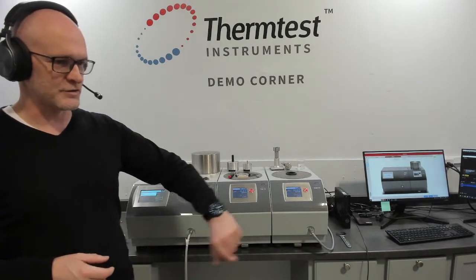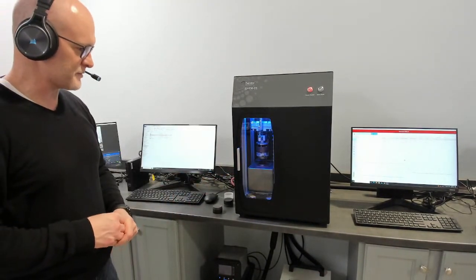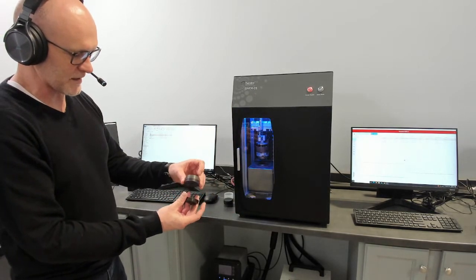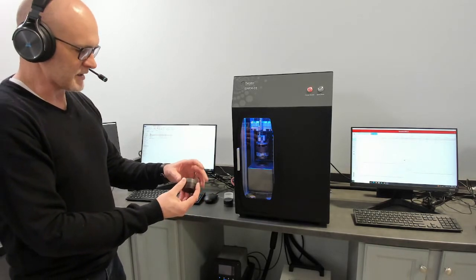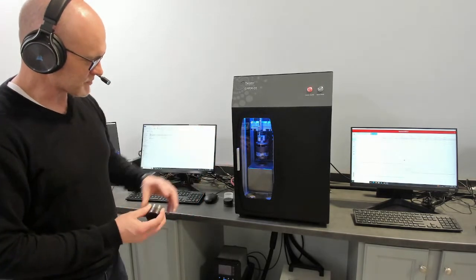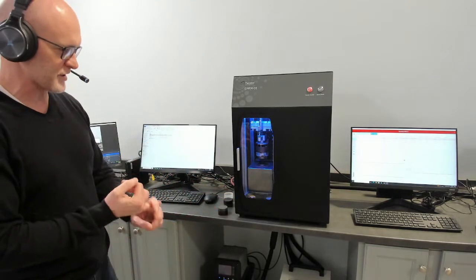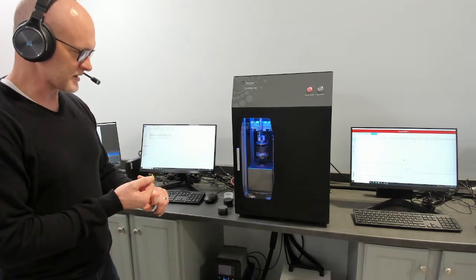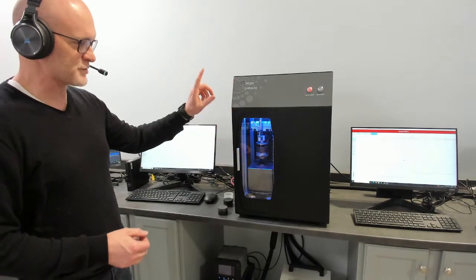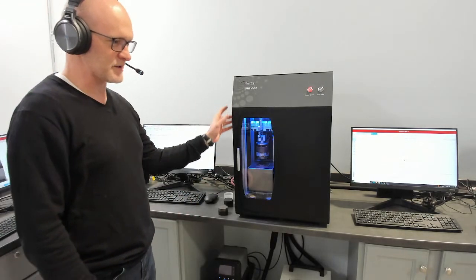So turning the camera to this side, we have the guarded heat flow meter, ASTM E1530, for measuring complex materials. The guarded nature of it, being a steady state, allows you to layer non-repeating layers and get a high confidence one-dimensional heat travel for thermal resistance. It auto measures thickness, so you get a result of thermal resistance and thermal conductivity. So ideally suited for complex structures that are non-repeating through the thickness and or heterogeneous. Temperature range, full temperature range, -20 up to 310 Celsius, plate temperature. So again, ASTM E1530.